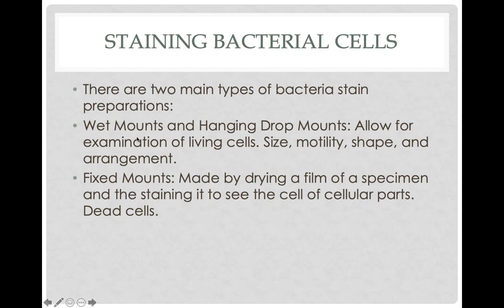Well, anyway, a wet mount sounds exactly like what it is. If you want to look at something move, swim, eat, function, do its actual day-to-day thing, you're going to want to take a little sample of water or a little sample of agar or whatever, put it on a slide, and then watch the little small microscopic organism swim around through that drop of water. Watch it move, watch it do its thing, watch how it navigates, watch how it responds to food and things like that. It gives you quite a lot of details about the size of this organism, how it moves, what its shape is, how it's put together, and things like that.